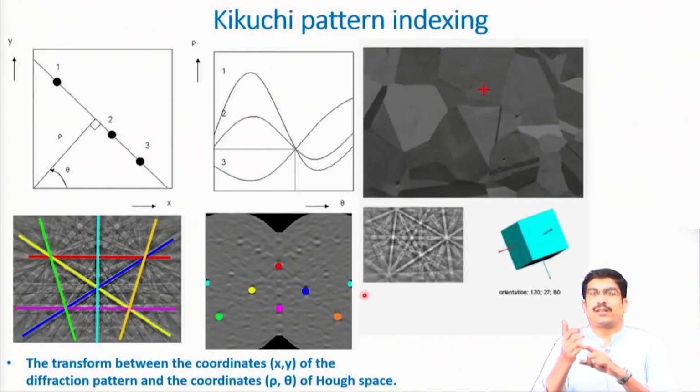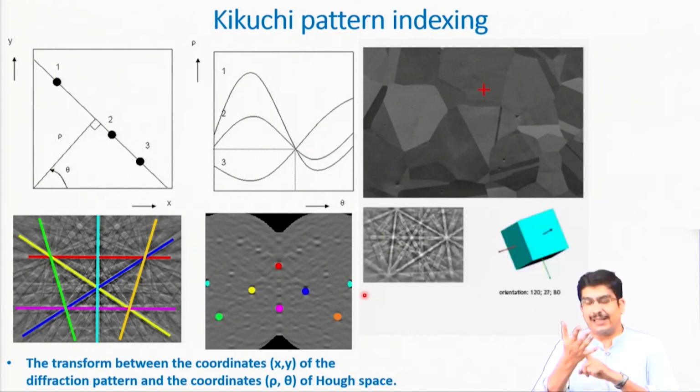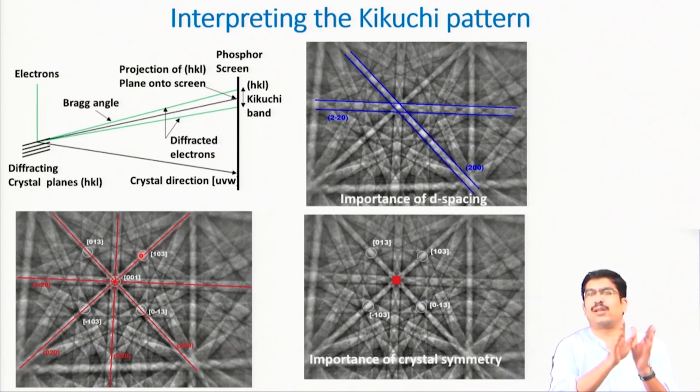Okay. For Kikuchi pattern indexing, basically what you want is automatic indexing. If you have this kind of Kikuchi pattern, you can sit with the material information and try to identify it, just like solving a diffraction pattern, and it is possible. You can have a library function, you can have various libraries, and know that if this is the crystallographic orientation, then this kind of Kikuchi pattern I should get, and so on. Otherwise also you can possibly figure it out by solving it.